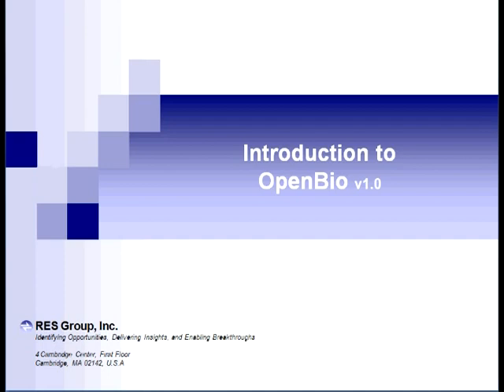The purpose of this video tutorial is to familiarize you with the basic structure and functionalities of OpenBio so that we can help you hit the ground running and minimize your startup time. So let's begin with what is OpenBio?